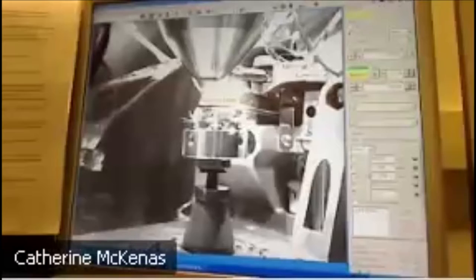Okay. Now we're going to get y'all's samples. We have the cricket body and head. We actually removed the head, and we have some cool things to look at there. We have the lichen. We have the guinea pig food and poop side by side. And we have the cat hair side by side with Mr. Gap's hair in there too. We have all those samples to look at, and we wanted to see what you guys wanted to look at first.